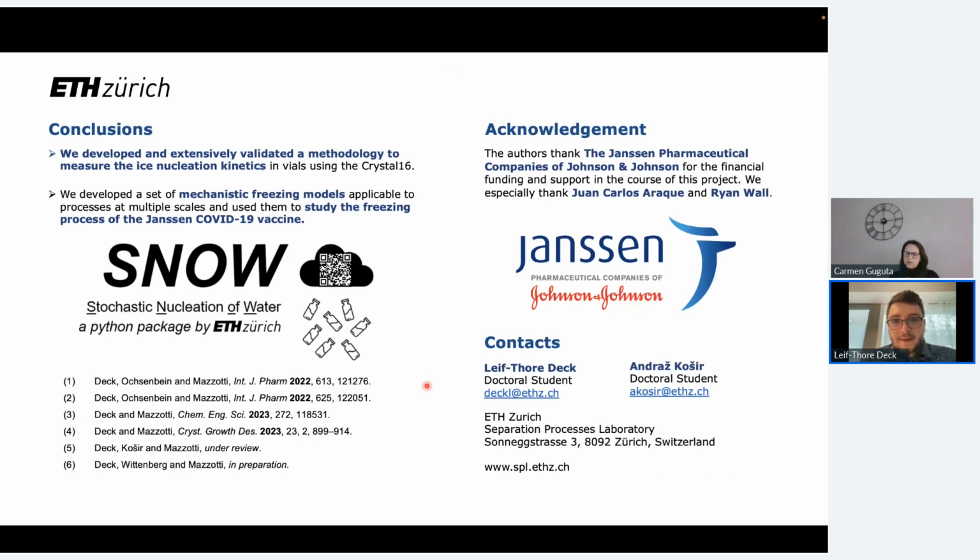And with that being said, I'm at the end of my presentation. To summarize the two points, right? First, we really developed and extensively validated a method to measure the ice nucleation kinetics in vials. And then secondly, we developed these mechanistic freezing models that allow us to study freezing at multiple scales from the freezing of a single vial really up towards the pallet scale.